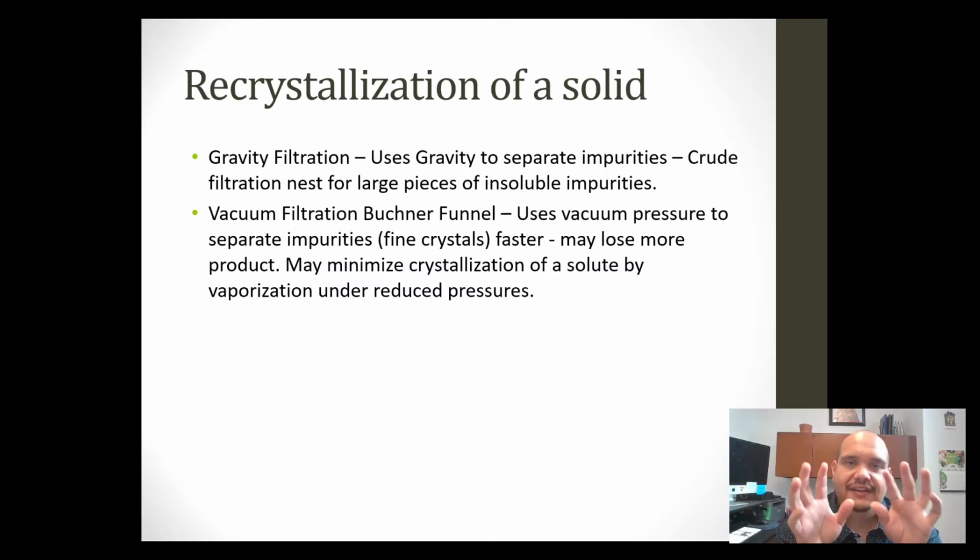Once that's done, if the solid looks good, you can do a melting point on it right away and take a weight. If it looks a little wet or saturated, just run it for another 5 minutes. And if that doesn't work, talk to your professor, because you could probably put it in the dry oven and save yourself more time vacuum filtering the solvent away.